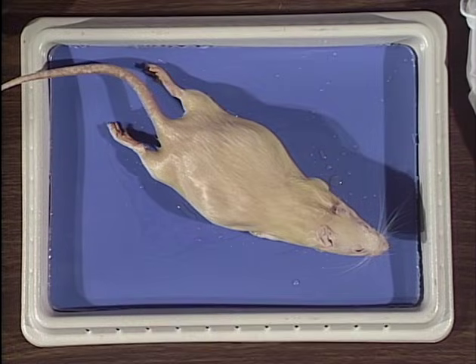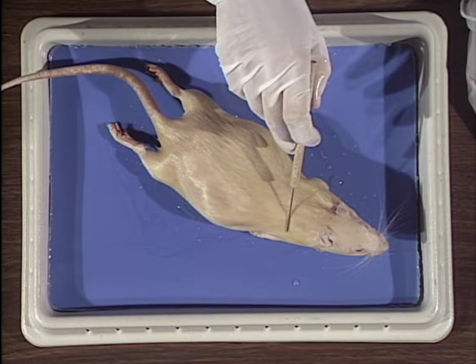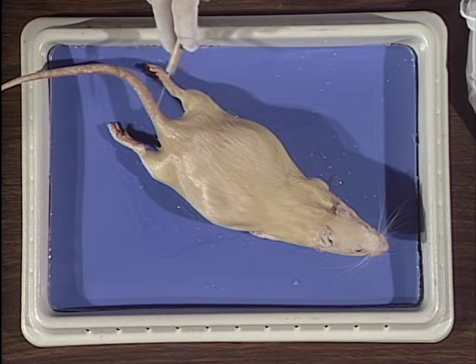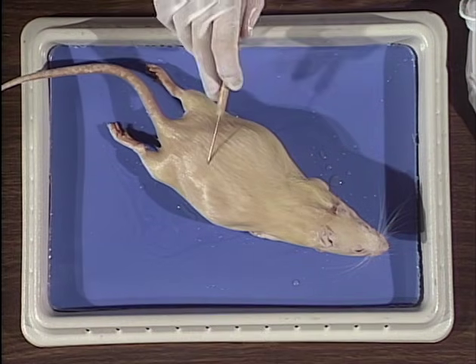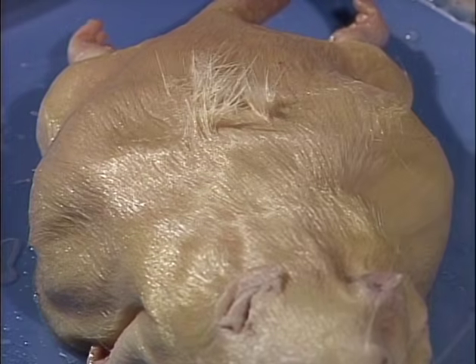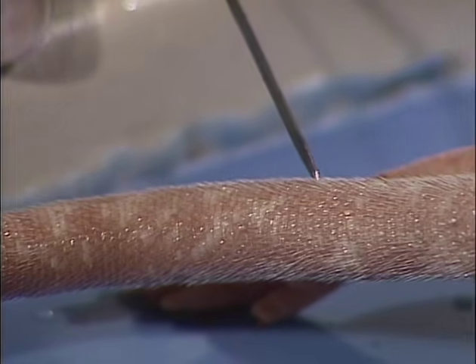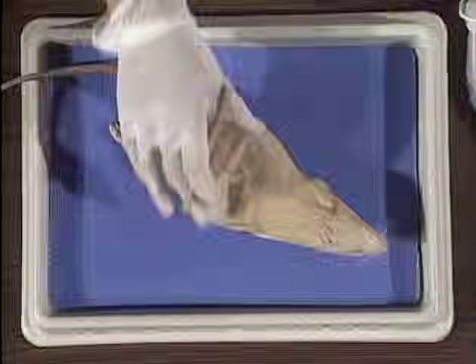We will begin our study of the rat by examining its external anatomy. Notice that the body is divided into a head, a short broad neck, a trunk, and a tail. The rat is covered with a thick coat of fur. However, the epidermal covering of the tail is quite different. It is covered with reptile-like scales.